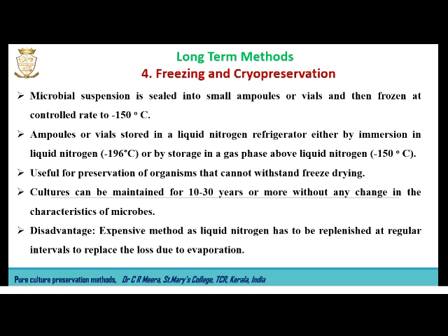This method is also very useful for the preservation of microorganisms that cannot withstand the freeze drying. This is a very effective method and by this method cultures can be maintained for 10 to 30 years and without any change in their cultural or other biological characteristics. But the disadvantage of this method is that it is a very expensive method as liquid nitrogen has to be replenished at regular intervals to replace the loss due to evaporation.